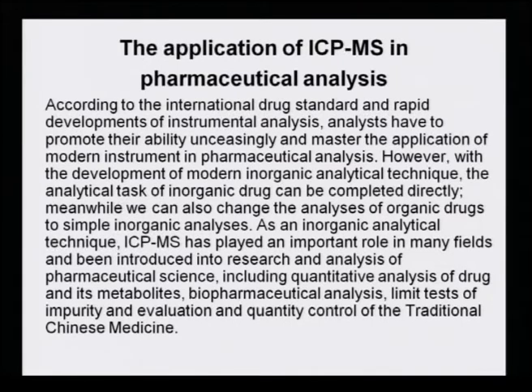Among inorganic analytical techniques, ICP-MS has played an important role in many fields and has been introduced into research and analysis of pharmaceutical sciences, including quantitative analysis of drugs and their metabolites, biopharmaceutical analysis, limit tests of impurity, whether the pharmaceutical preparation is pure or not, and evaluation and quality control of the traditional Chinese medicine, the TCM. Now, it has a varied application.